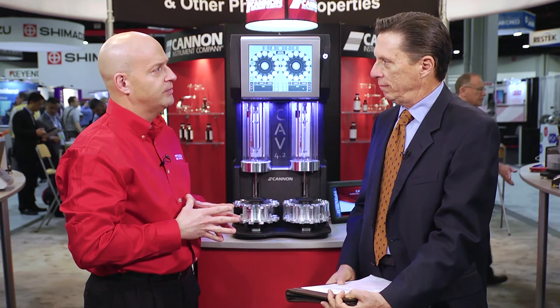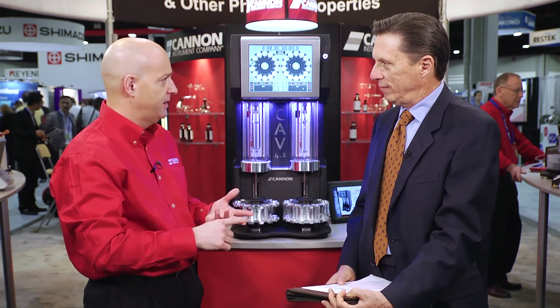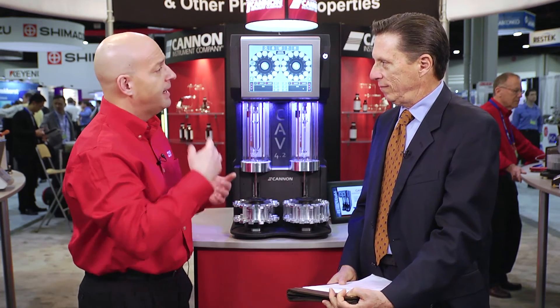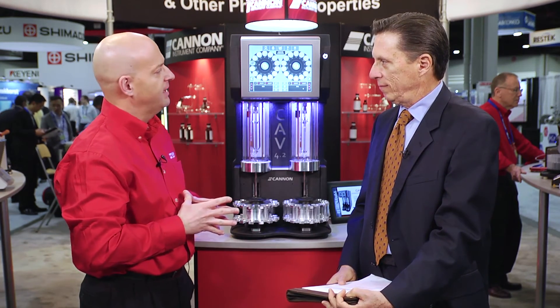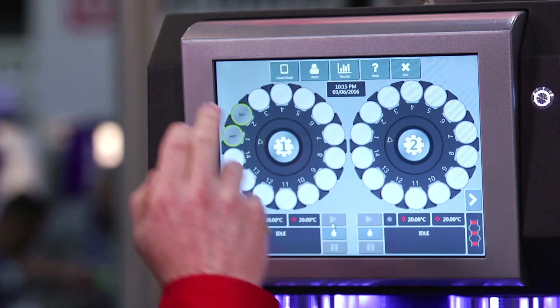Had we not had it set to a default test method, before entering the sample ID, the system would have asked what sample type — whether it would be a base oil, petroleum wax, an additive, or a formulated oil. After that, you would enter in the sample ID. Once you've entered your sample IDs, you simply hit the play button and the system begins the sample automation and testing.